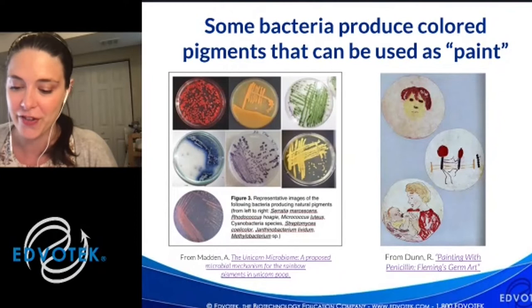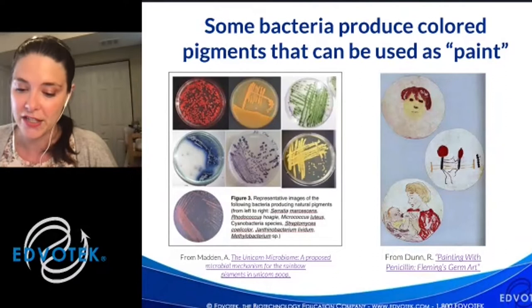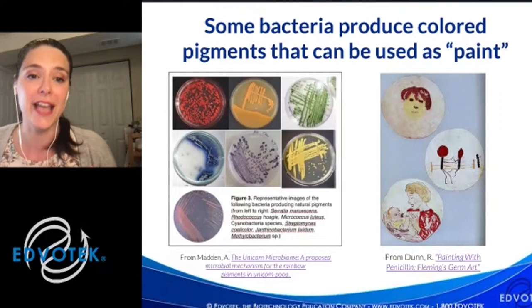Fleming had to find microbes with different pigments and then time his inoculation such that the different species all matured at the same time. These works existed only as long as it took for one species to grow into the others. When that happened, the lines between, say, a hat and a face were blurred. So too were the lines between art and science. And this is not a shock to me. There is a lot of trial and error and skill in both science and art.